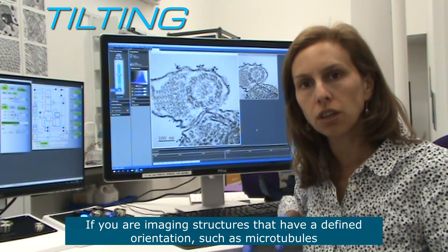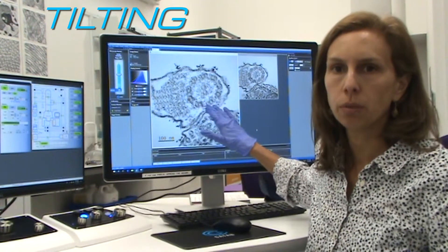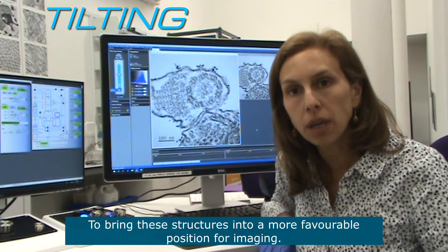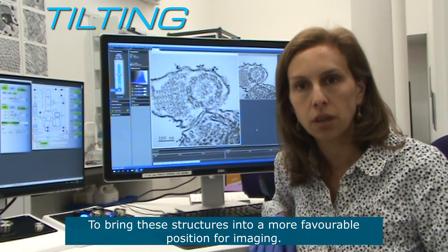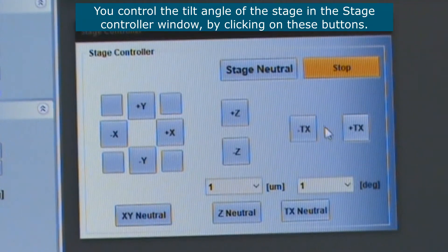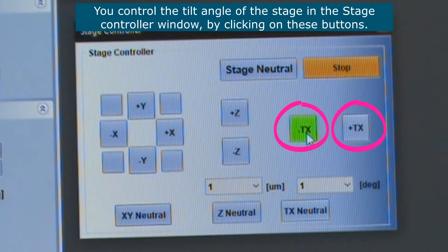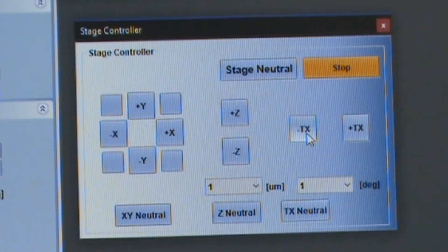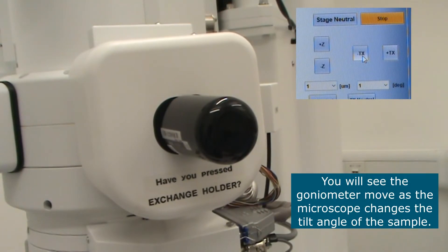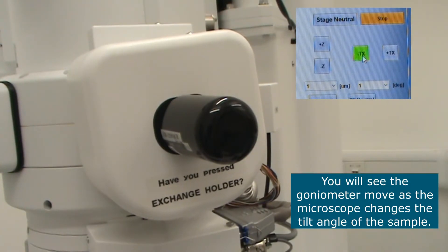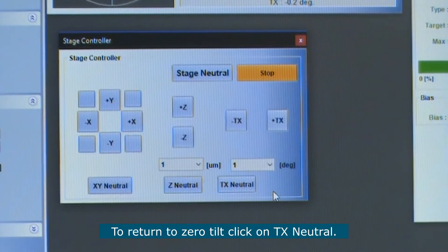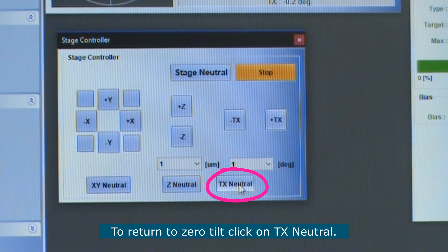If you're imaging structures that have a defined orientation, such as microtubules, the stage tilt function can be quite useful to bring these structures into a more favorable position for imaging. Every time you click on one of these buttons, you should see the goniometer move as the microscope changes the tilt angle of the sample. To return to zero tilt, press TX neutral.